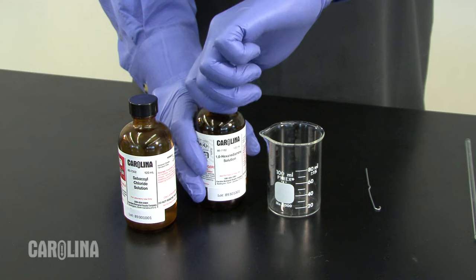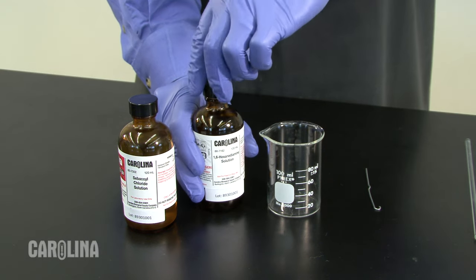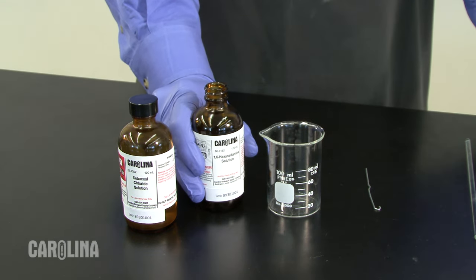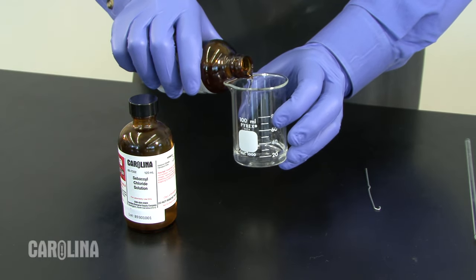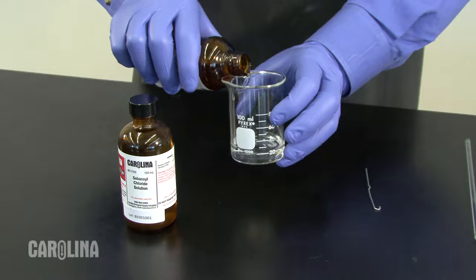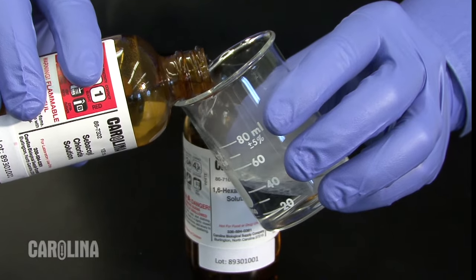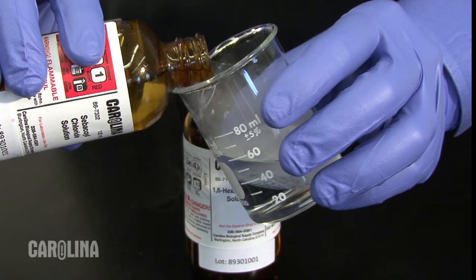To make nylon, we simply place the two monomers in the presence of each other. First, obtain a 100 milliliter beaker and pour in about 25 milliliters of the 1,6-hexanediamine. Tilt the beaker slightly and slowly pour in an equal amount of sebacoyl chloride.